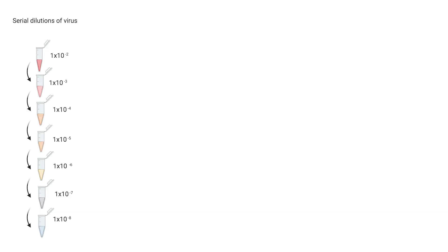Briefly, the process involves inoculating cells with various dilutions of the virus preparation. As you can see here, we have prepared dilutions ranging from 10 to the minus 2 to 10 to the minus 8 of the virus.